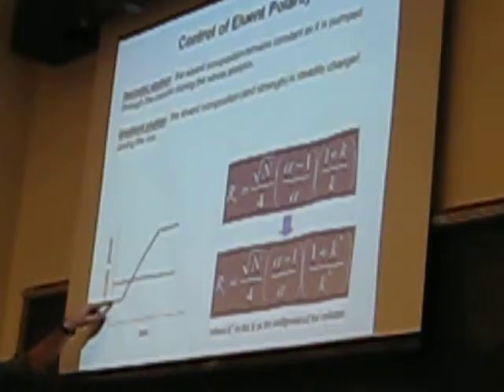And over time, you would gradually be mixing so that the percent of one mobile phase would become less, and the percent of the other mobile phase would become more. So that by the time you reach the end of your elution time, the mobile phase is 100% of the other buffer and none of the first buffer, right? So you had buffer A and B, and the percent of A would decrease, the percent of B would increase over time.